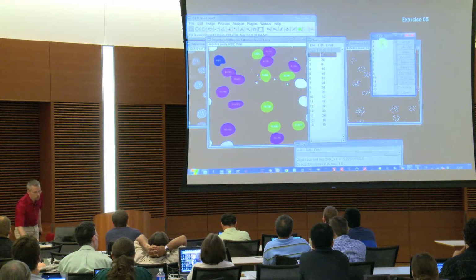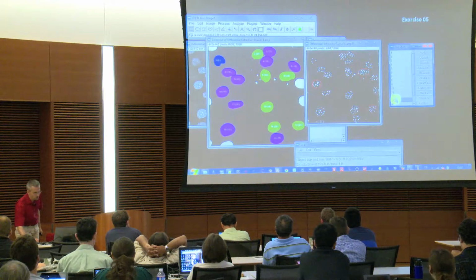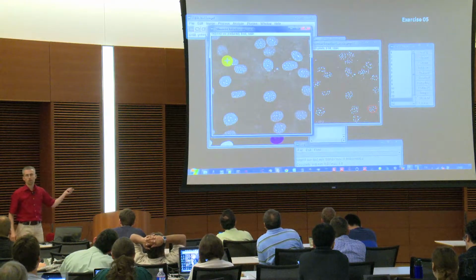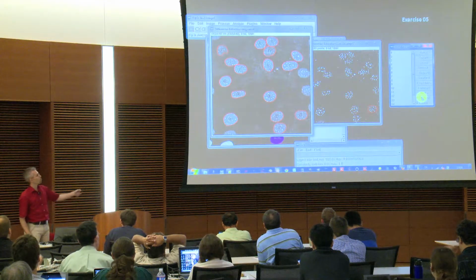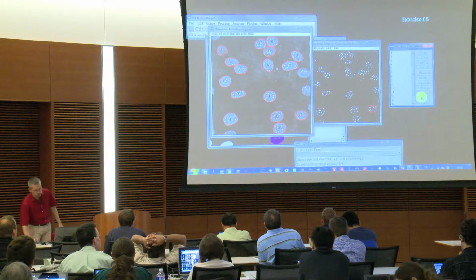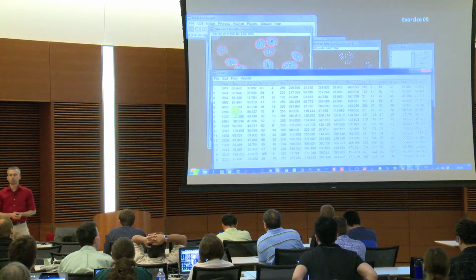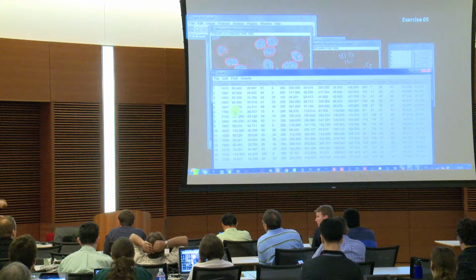And I have the ROI manager with the object numbers, which has the advantage that I can again check how my ROI looked. And I can go in a second step to my original image, do a background subtraction, normal noise subtraction, and actually use that to transfer all the ROIs I have here for the objects of interest, and can then do an intensity measurement by simply going to measure and looking at the column with the heading mean, which is the average intensity, which is normally the standard value we use to compare these objects to each other. So you don't need to sit down and make manual ROIs.